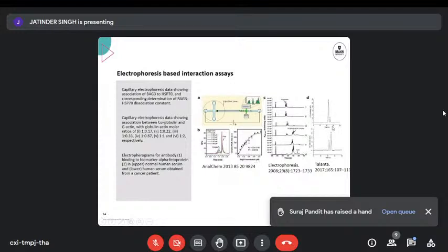So here we can see an antibody antigen complex, where at one concentration the fastest one will be the smaller one, so the analyte. So here we've got little binding. Here we've got the situation reversed, our slower peak has grown. So through the ratio of our peaks, we can determine how much binding there's been going on, and we can derive a binding constant plot. So in here, alpha fetoprotein and human serum, we can see how much they've interacted together.